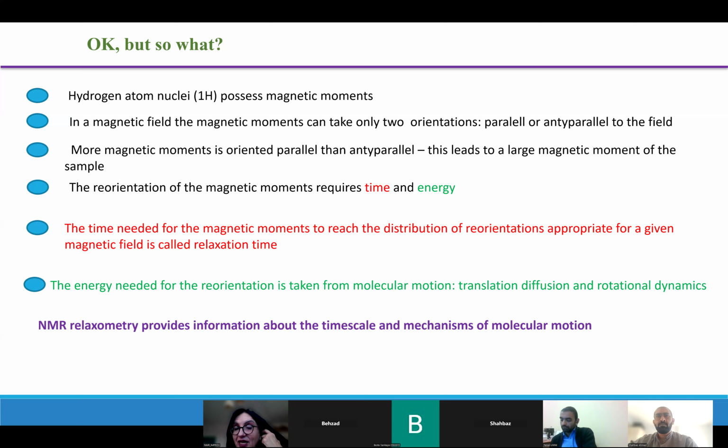Because after all, we have a glass of water, including many molecules. And the molecular surrounding is called lattice. Therefore, this process is called spin-lattice relaxation because it involves interactions with other objects, which we call lattice. It's actually a historical story because it started probably with crystal lattice and some phonon transitions and so on. And then somehow this concept survived, which can now be somewhat not clear at the beginning.